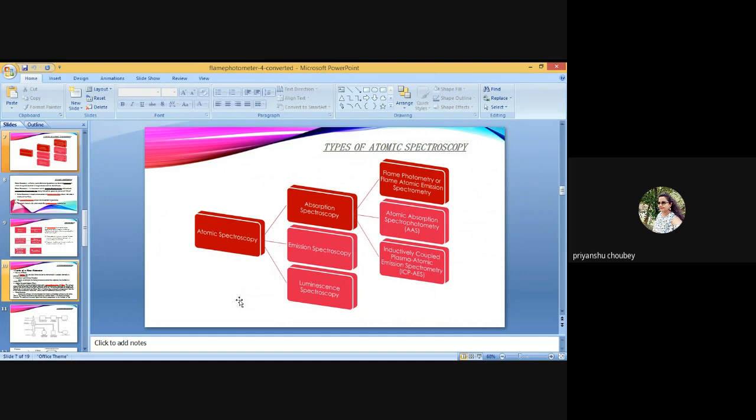The principle of ICP-AES is based on the observation of atomic emission spectra when samples in the form of an aerosol, thermally generated vapor, or a powder are injected into the inductively coupled plasma atomization and excitation source.